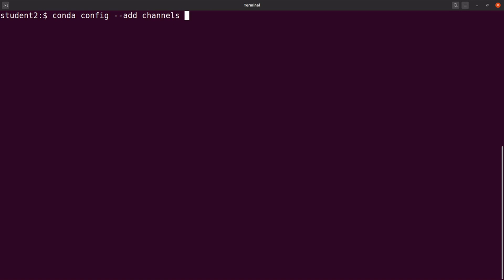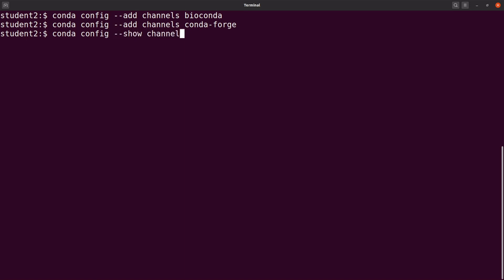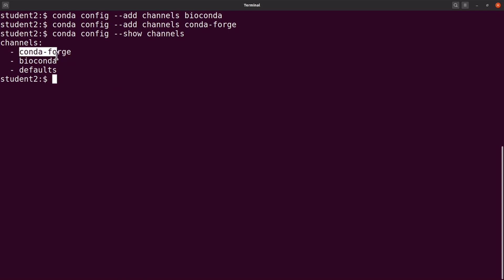Let's add the first channel, which is BioConda. Then let's add a second channel: conda config --add channels. The second one is Conda Forge. That is done. You can also check the channels that you have added by saying: conda config --show channels. And you will see that the two channels are here. The default one comes packaged with Conda, so we leave it as it is.